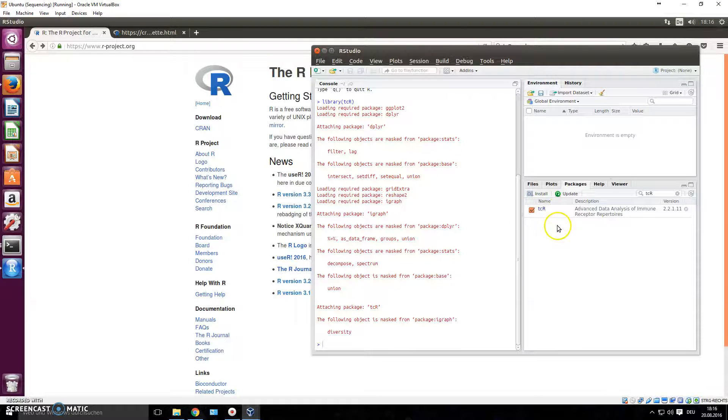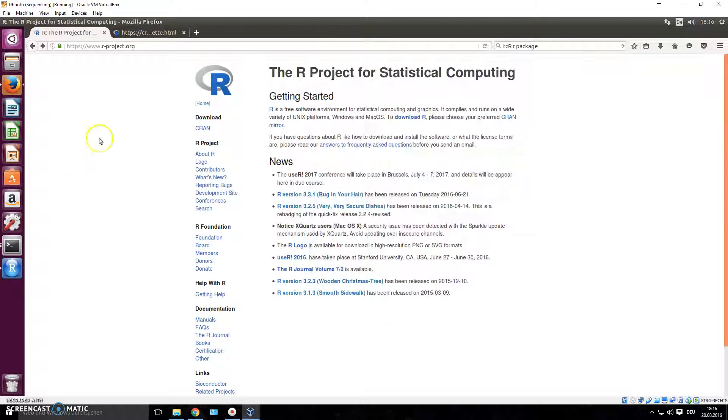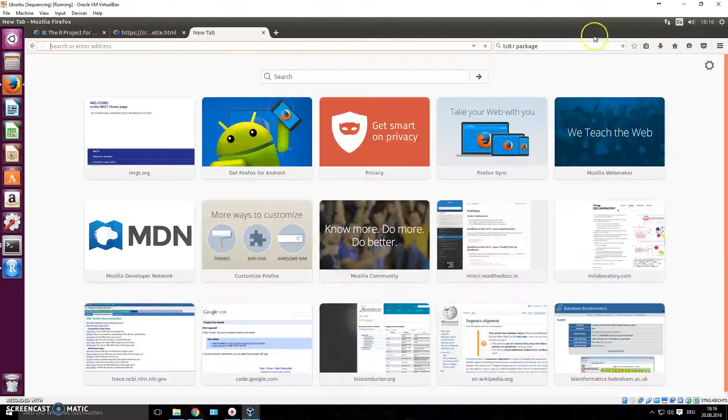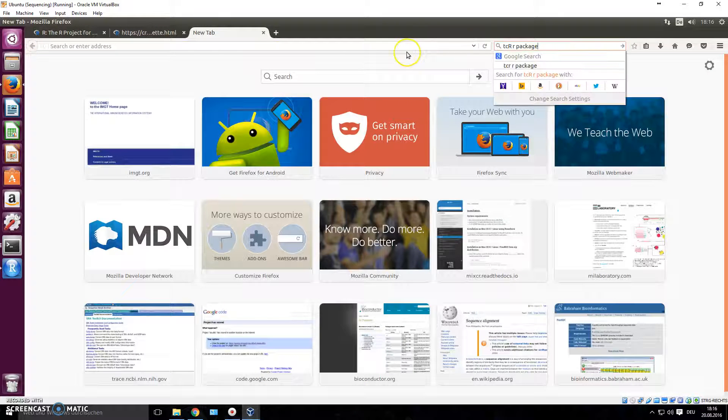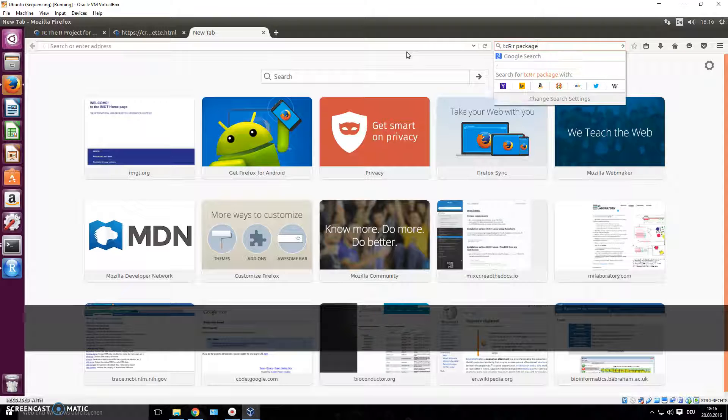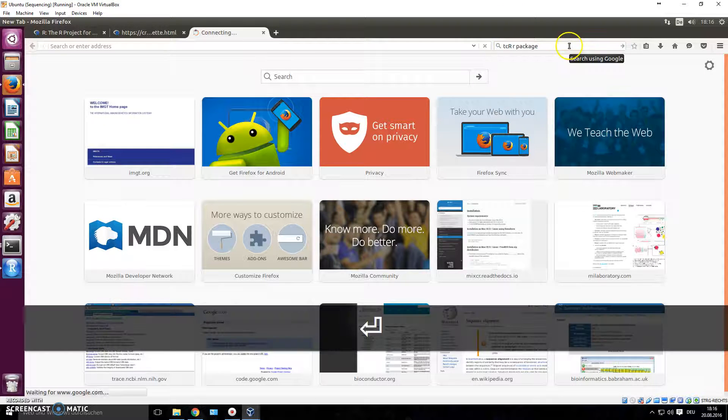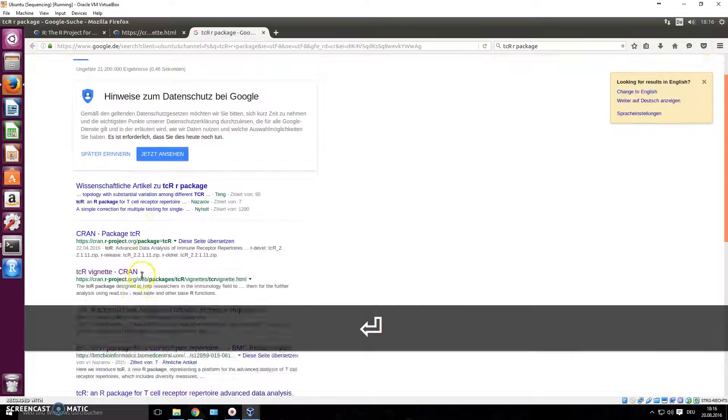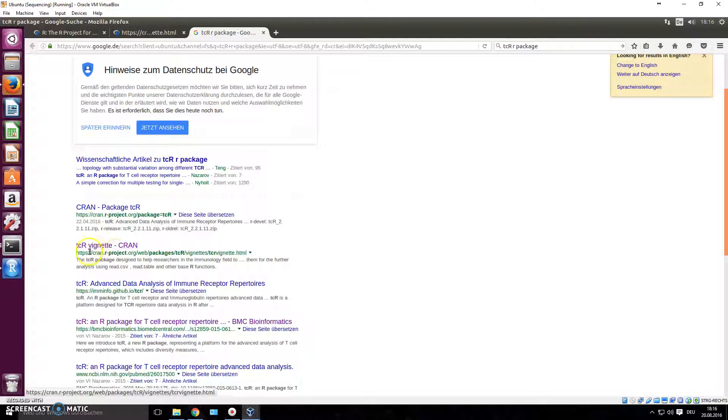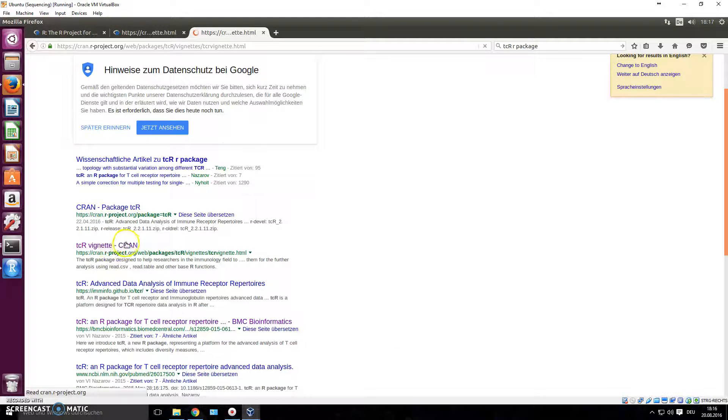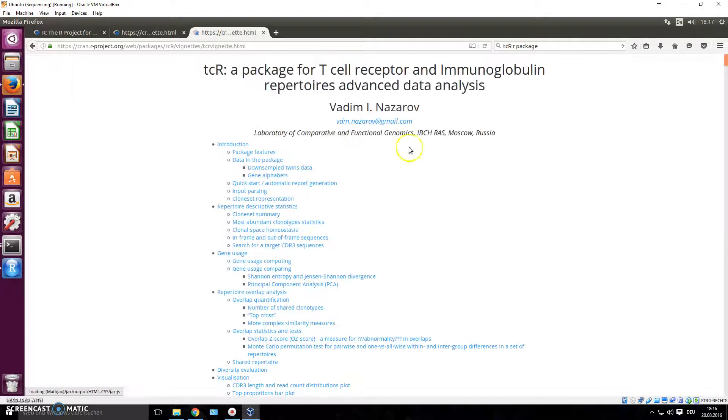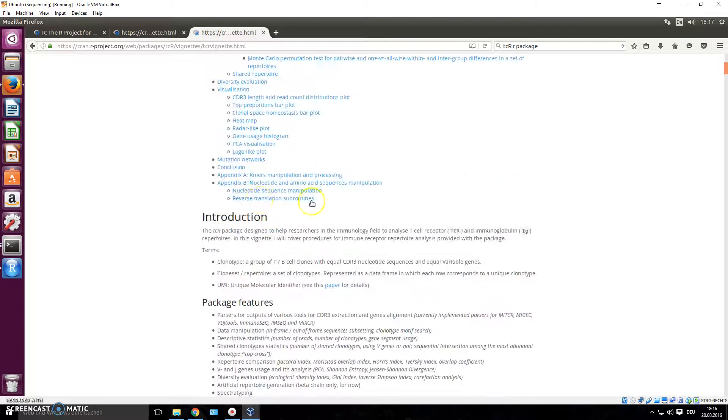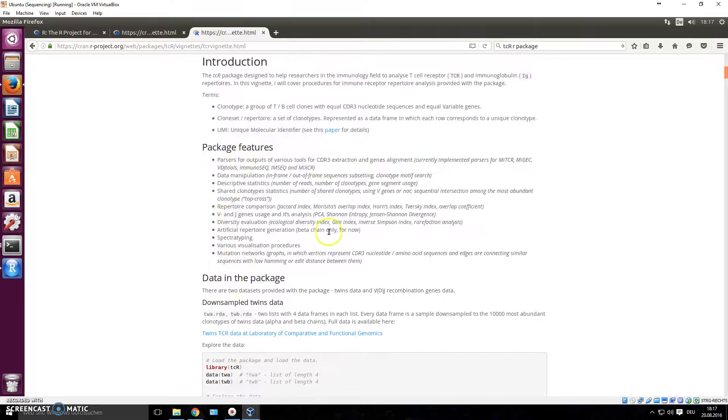Let's now find the documentation for this package. You can do this by - I have it open here - but you can find it by just Googling tcR. I've already written it: tcR R package. Press enter and it should get you to this website right here. I don't know how to pronounce this, vignette or whatever, but this is basically the help file or the documentation for this program.